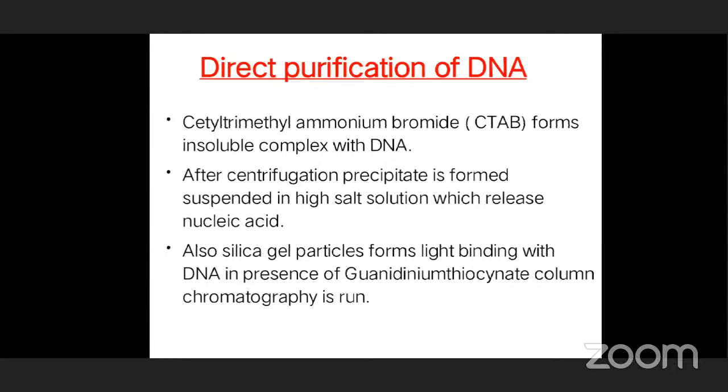Also, there are silica gel particles binding with DNA in the presence of guanidine thiocyanate, and column chromatography is run.